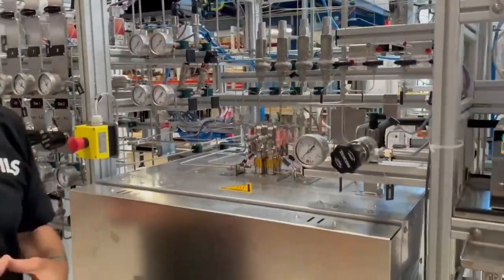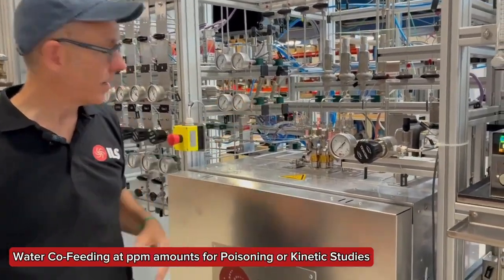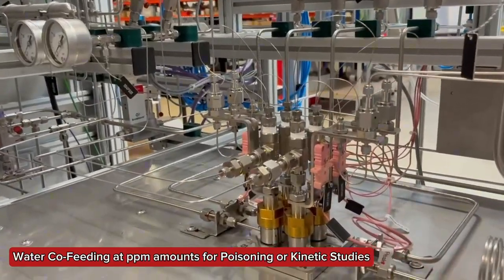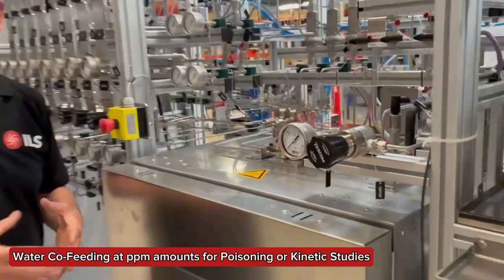We also have the ability to co-feed very, very low amounts of water. As you see here, these are 1/32-inch feed tubes, so very, very low dead volumes, so that we can really dose sub-milliliter quantities per hour of water — looking at, for example, poisoning studies.